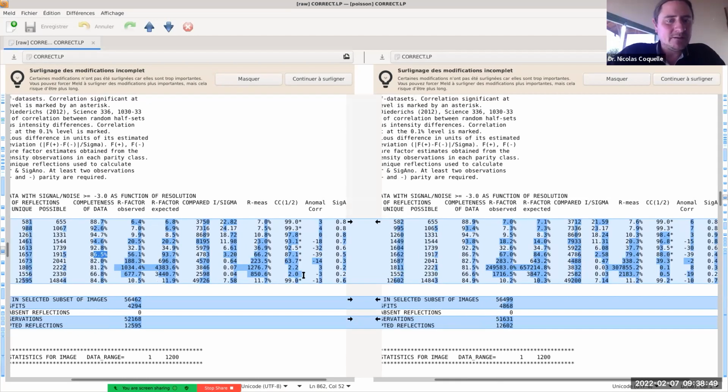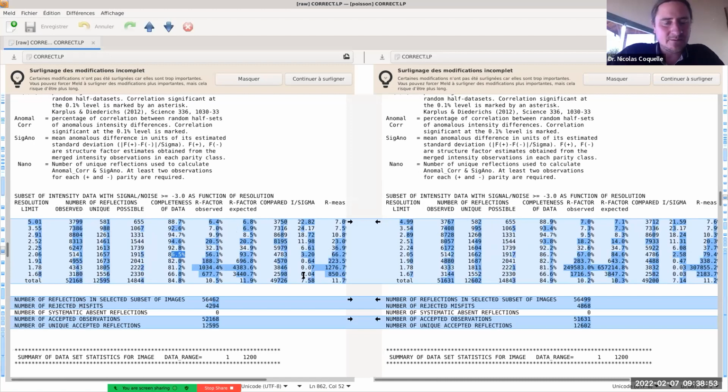But with oscillation data, what we had in our hands was some oscillation data and FOFO maps, and we could still get the same features, not at the exact same level, but reasonably identical levels.